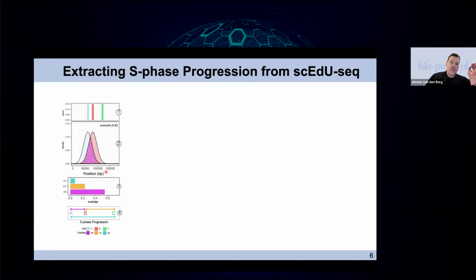So as you can see over here, we can now fit a distribution, which we picked the Gaussian distribution in this particular case, and then we overlaid them on the center of this blue and red.